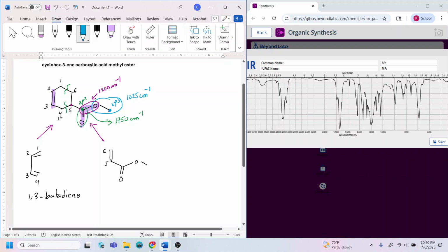Now, position number 4 and 5, because they asked you to label 5 functional groups in there. It's going to be for the alkene, you guys, because I do have my C=C of the alkene. So this is going to be the C=C of the alkene. And the C=C of the alkene has 2 vibrations.